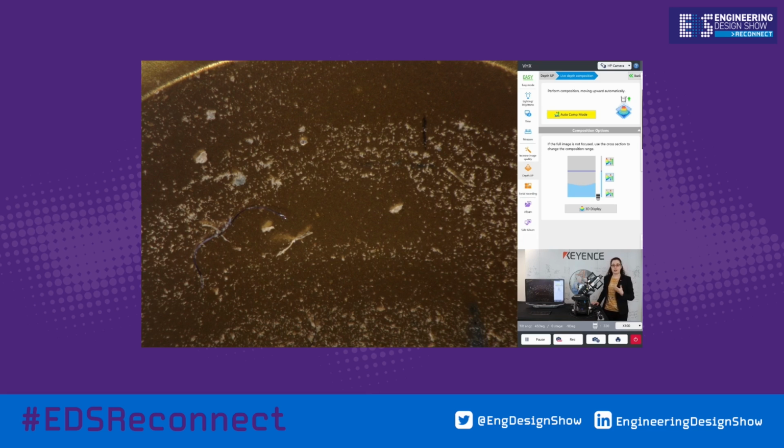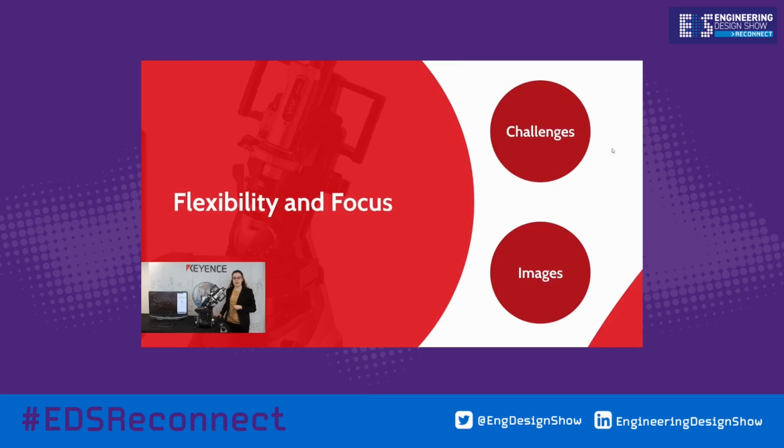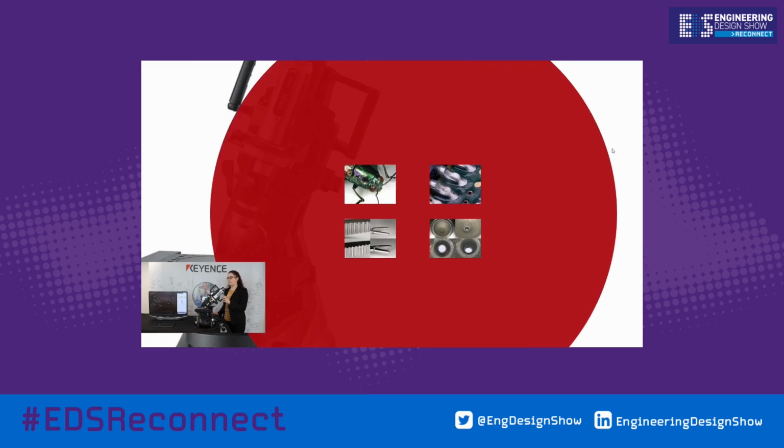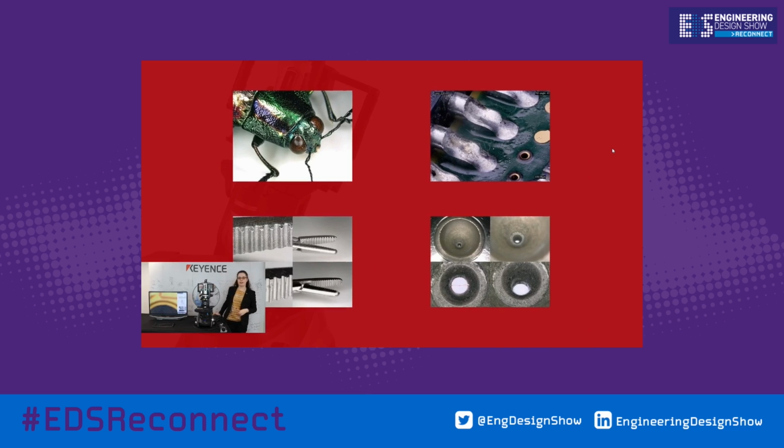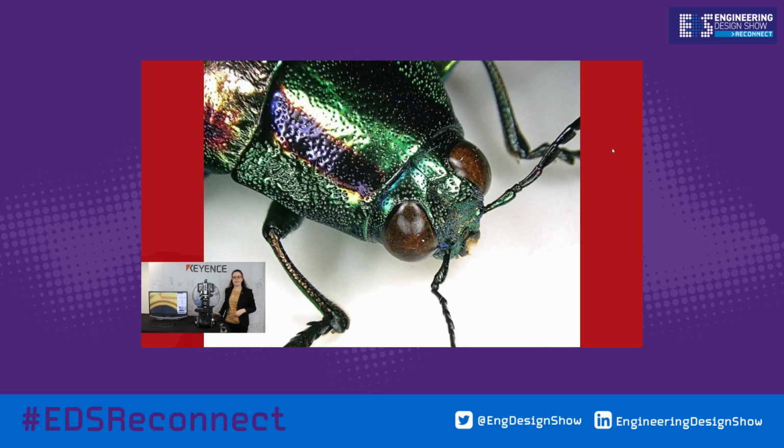So just to go back and show you, I'm just going to show you a couple of images that sort of highlight how this is useful as well. First image is our bug. Now with a traditional microscope, you'd have this on the stage and you'd just be looking top down. You would get none of this sort of more photographic view of the bug itself. With the tilting and the manoeuvring of the stage, you can really see the colour and the shine on the bug's shell, as well as being able to get a good look at its face and its eyes.